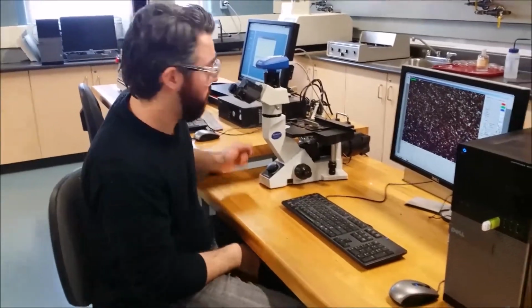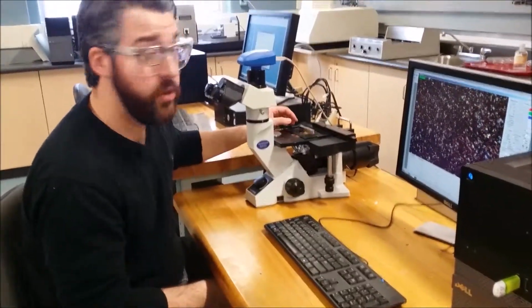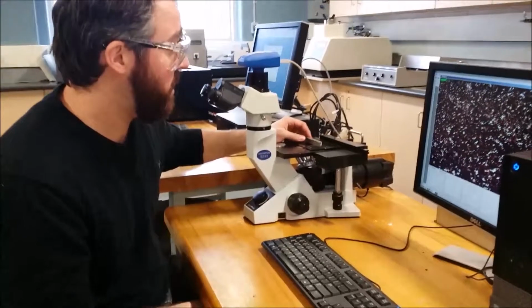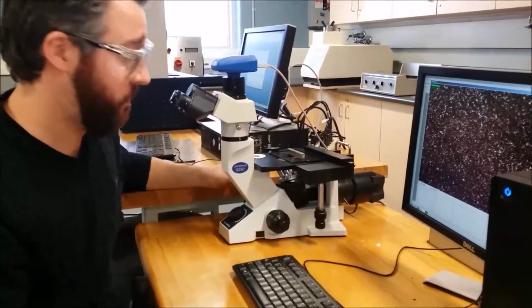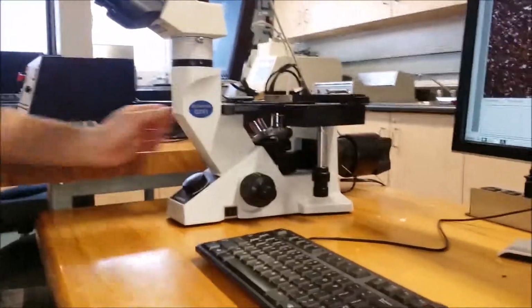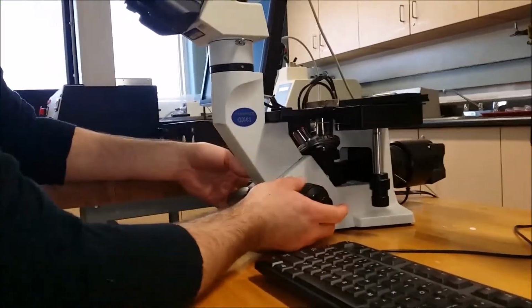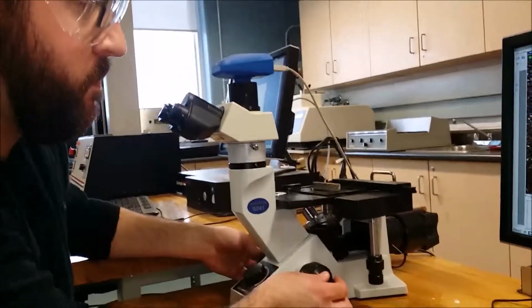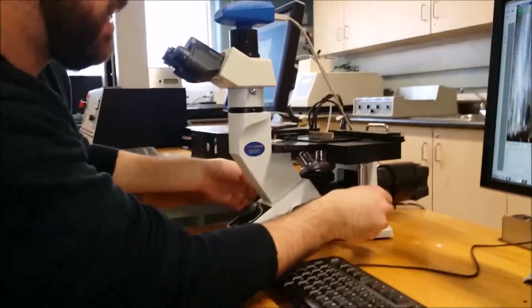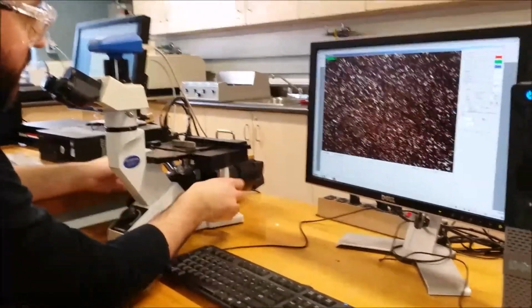This is Steve again. Now we're going to talk about our microscope setup. First, you want to place your piece in the center of the plate. You want to start at your lowest magnification, that way you can get an idea of what you're looking at. Right here, you have your focusing knob. Over here, you have your X and Y axis, so you can see it scrolls over the piece.